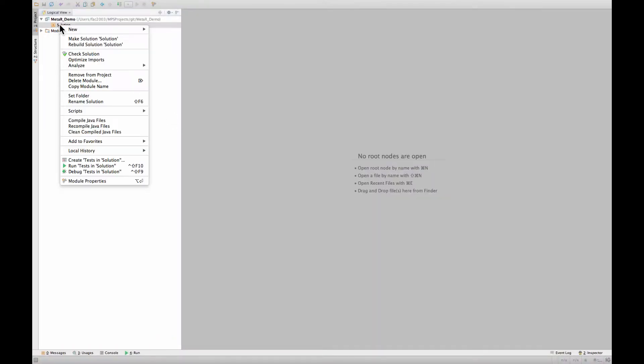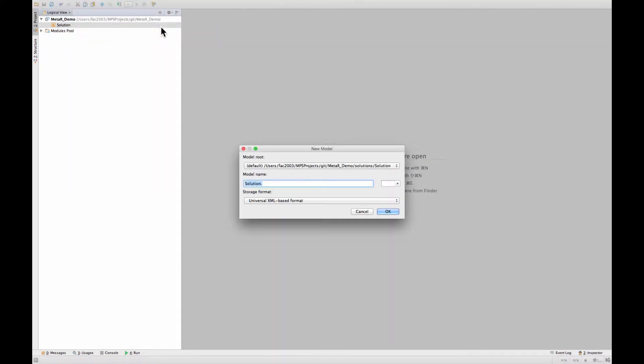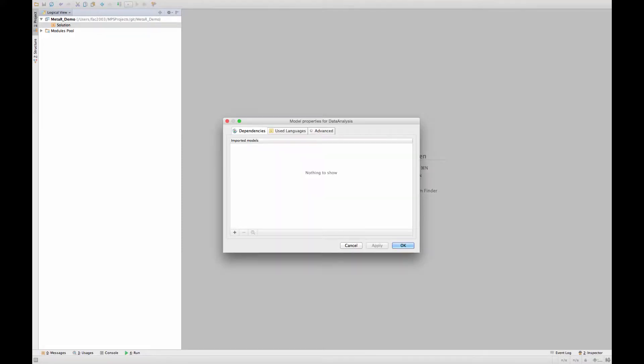We start with an empty solution in which we are going to create a model. We will call this model data analysis and we will define a couple of things in this model.